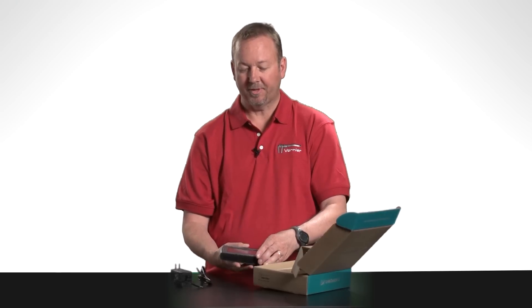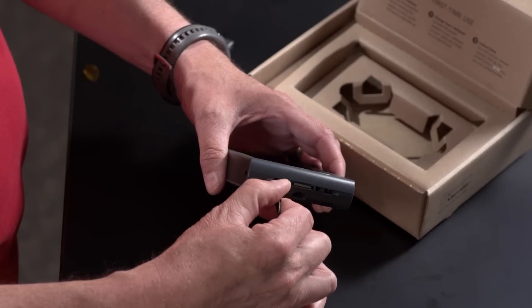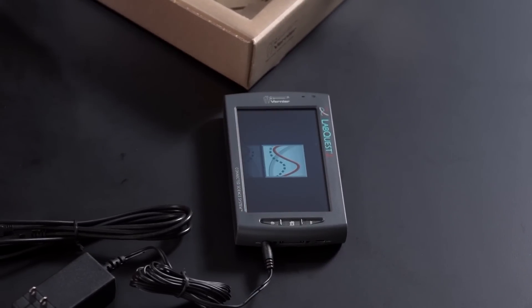LabQuest 2 batteries come with a partial charge. The next step is that you charge for a full eight hours. So insert the AC adapter and charge for eight hours to ensure that you have a full charge on your battery.